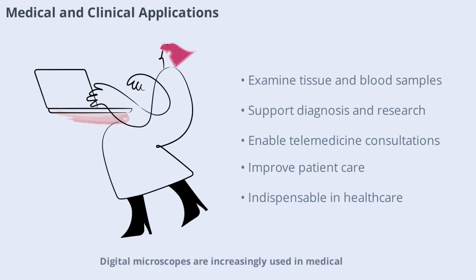Digital microscopes are increasingly used in medical and clinical settings for examining tissue samples, blood smears, and microorganisms. Their ability to capture and share images supports diagnosis, research, and education. Telemedicine applications allow doctors to consult with specialists remotely, improving patient care. The clarity and documentation capabilities of digital microscopes make them indispensable in modern healthcare.